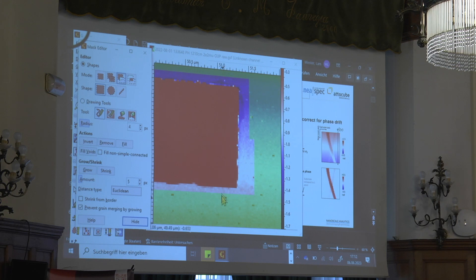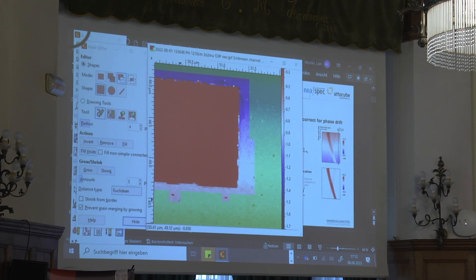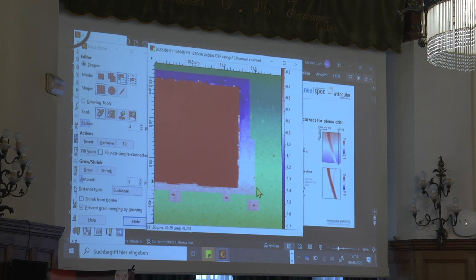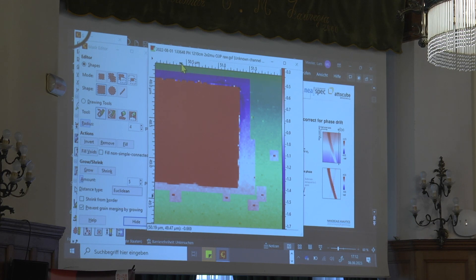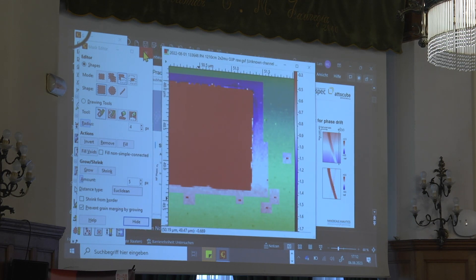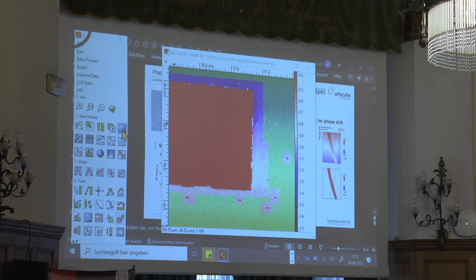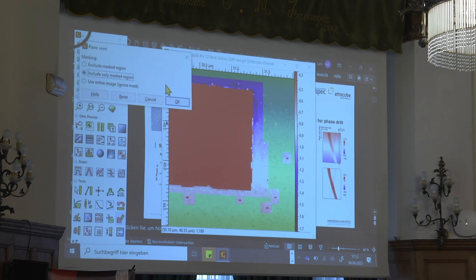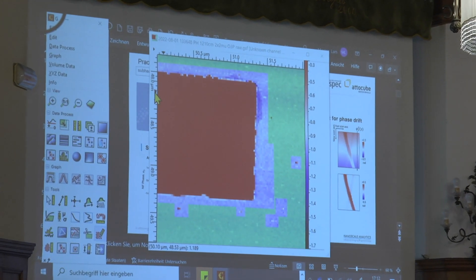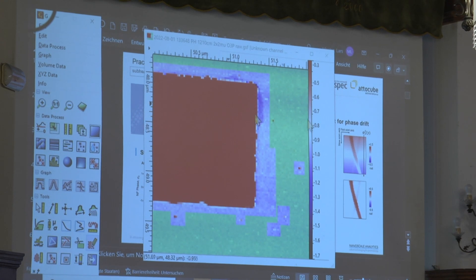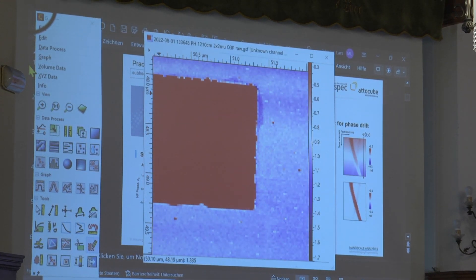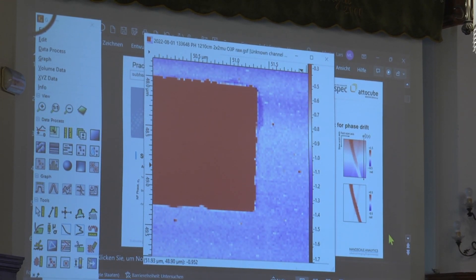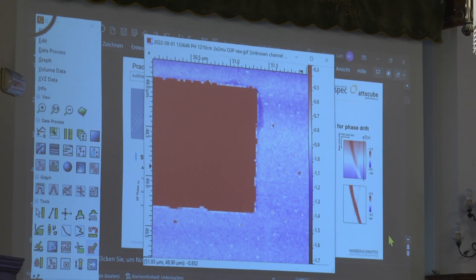You can make it arbitrarily complicated. If you look closely, there's a lot of dirt on the substrate. Do you want to include this in your fit, or do you want to exclude it? In Gwydion it's very easy to exclude this — to program, it's harder. So now this is flat. This is what you can do with Gwydion.